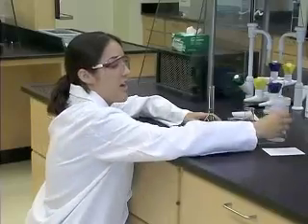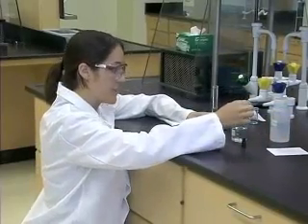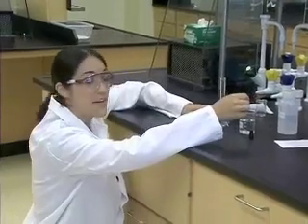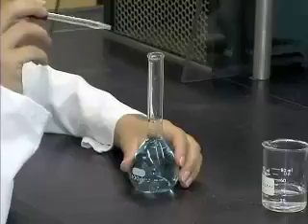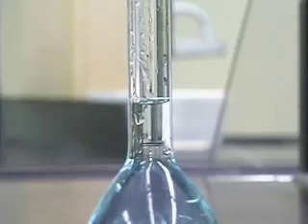Now that I'm close, I'm going to use this dropper to continue adding water. I want to make sure that my eye is level with the calibration mark so that the meniscus rests just on the mark. This will be 100 milliliters.